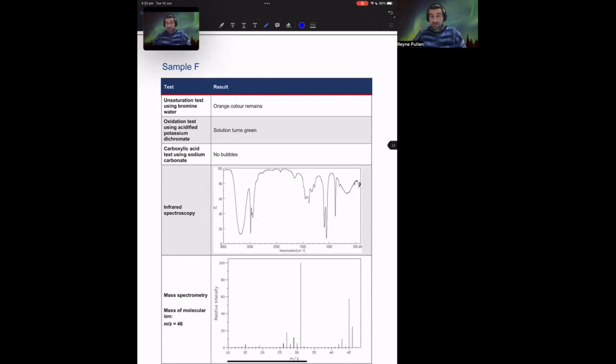As I mentioned in the sample B recording, I'm going to speed up the process for the remaining ones. So I'm going to jump straight into it. We're looking at sample F.